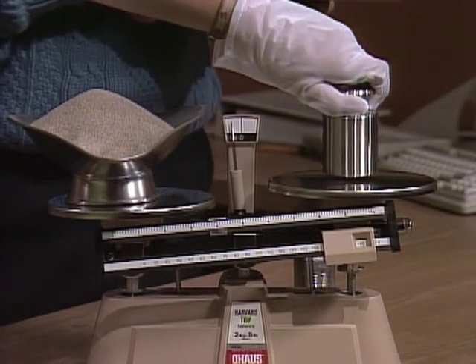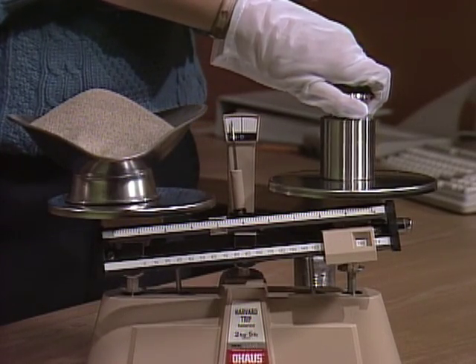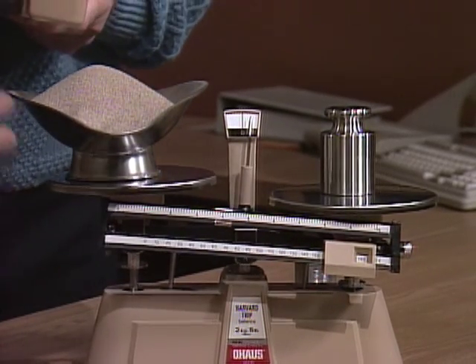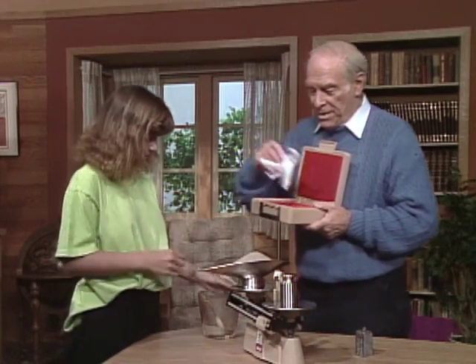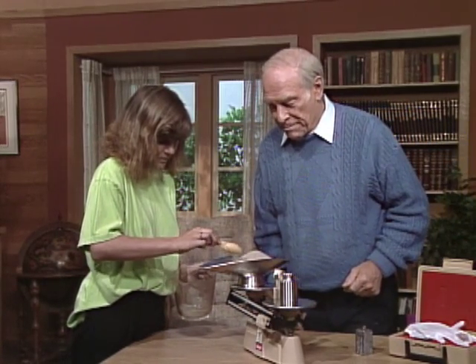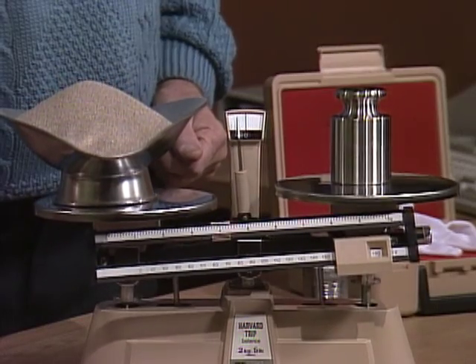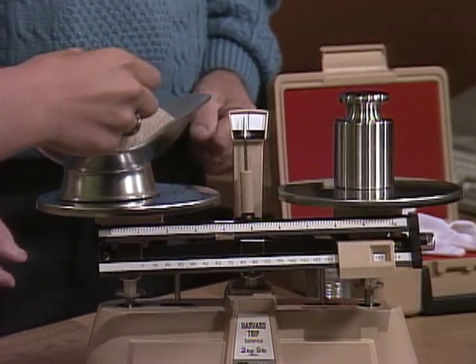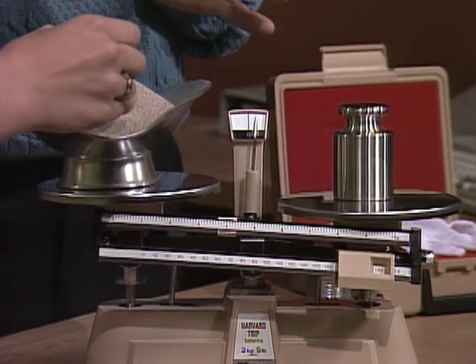Take this one off and put on the very carefully controlled one-thousand-gram weight over there, and see if you really do have one thousand grams. It's way too much — okay, you've got to take a little out.